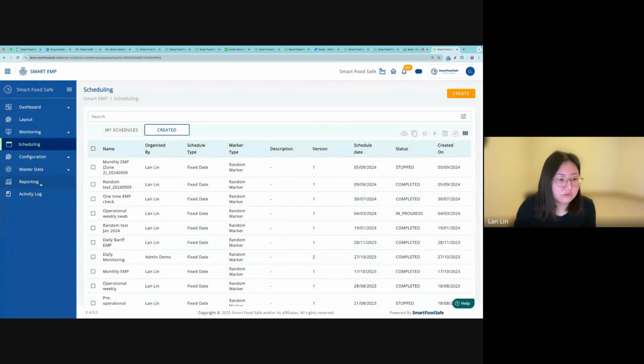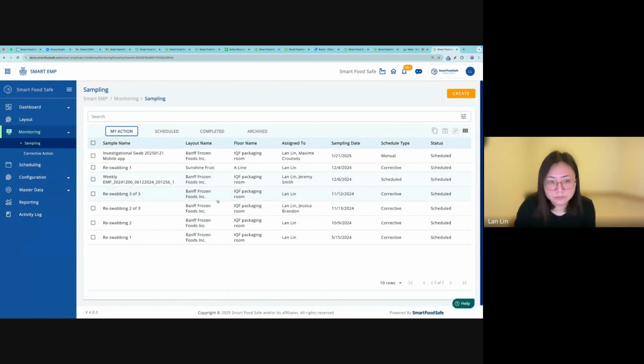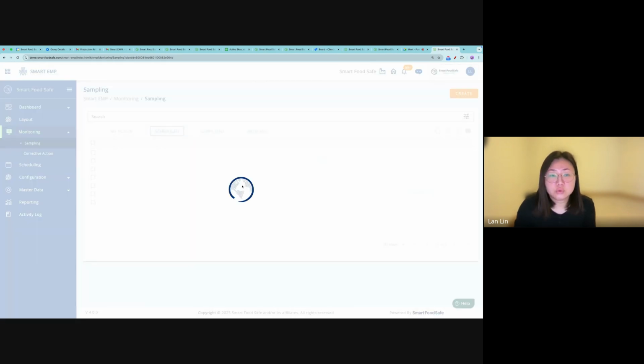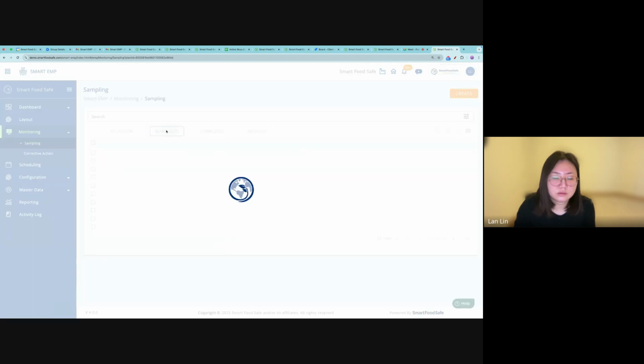Now we have configured everything, and it's time for us to start doing the sampling records. Oops, I have the bug again. Yeah, there is something wrong in my demo environment.